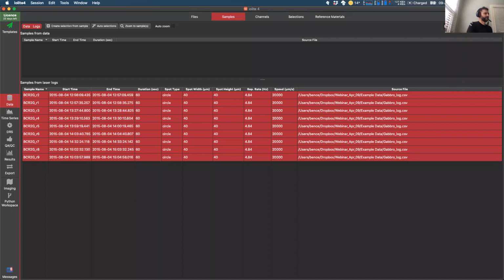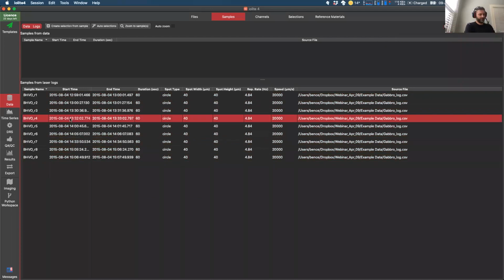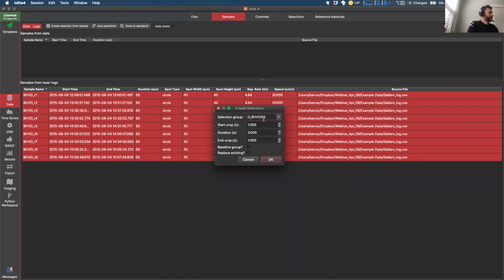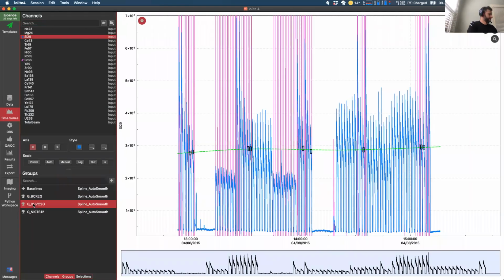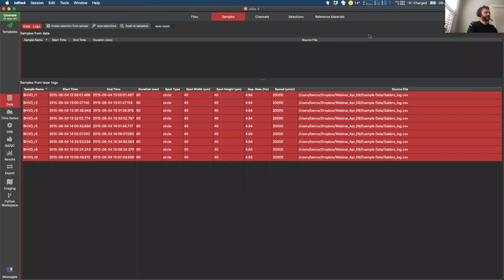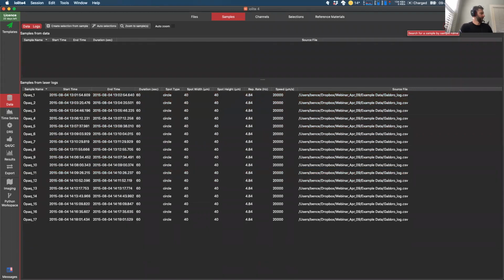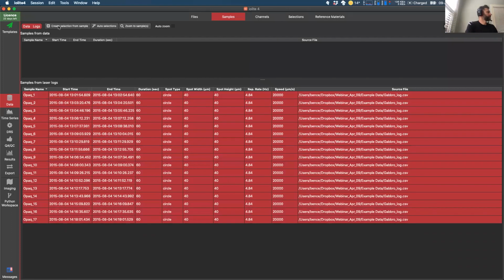And if I go here and type in BH, it will select all of our BHVO samples. So now we can add those as well. And now we have BHVO selected. And we'll repeat the same thing for our opaques. So this time, for our opaques, we will select all of them. We'll click on this Create Selection from Sample button.